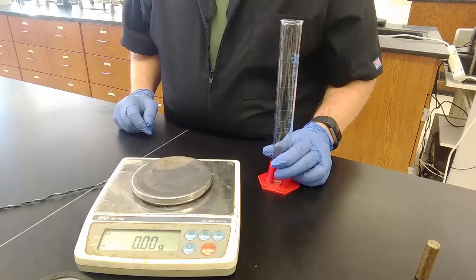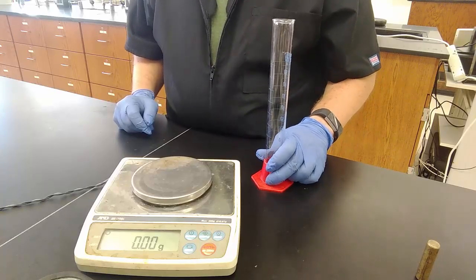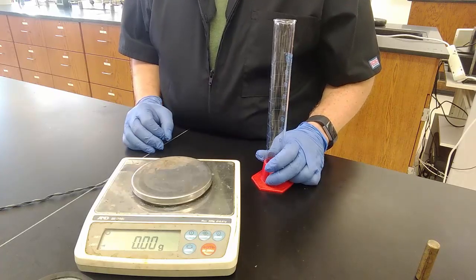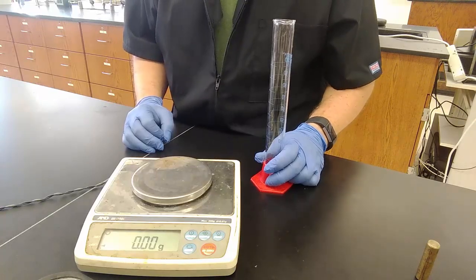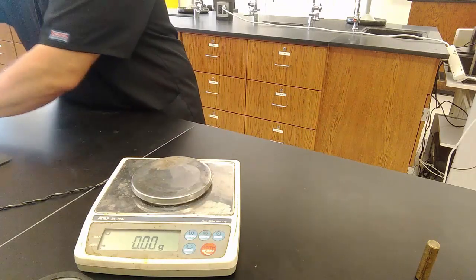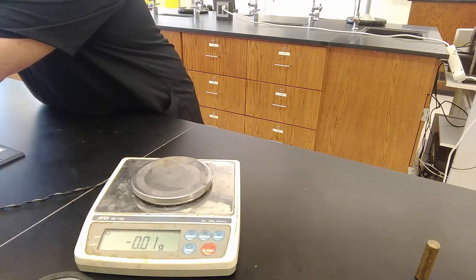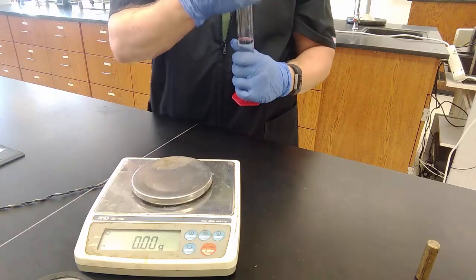The lab manual uses its language very carefully because I've written a few editions of it at this point, and I choose my words for a reason. About 50 milliliters means exactly that. About. Not exactly anything. About. So I'm just going to put some water in here. Take your time to be exact when you need to be exact, and take your time not to be exact when you don't need to be exact.